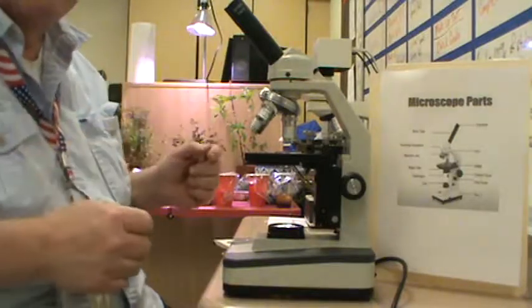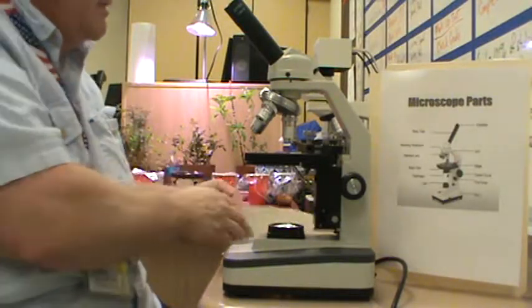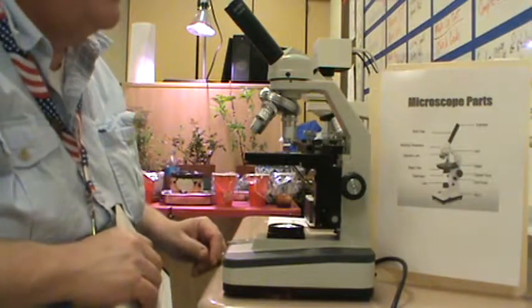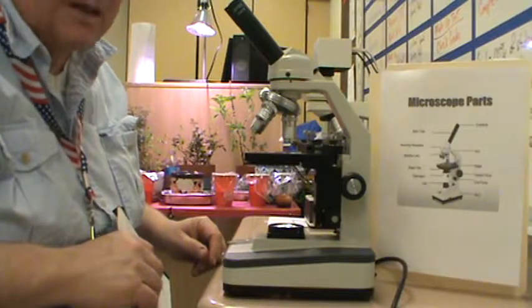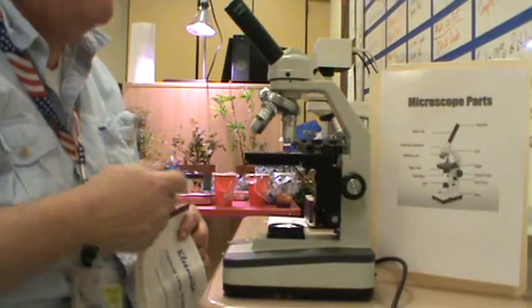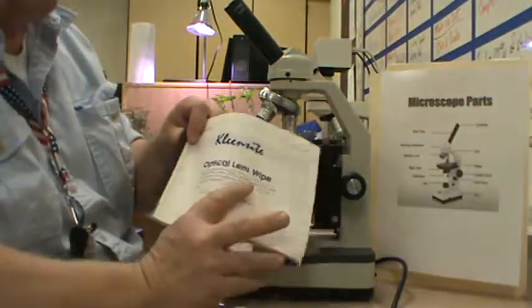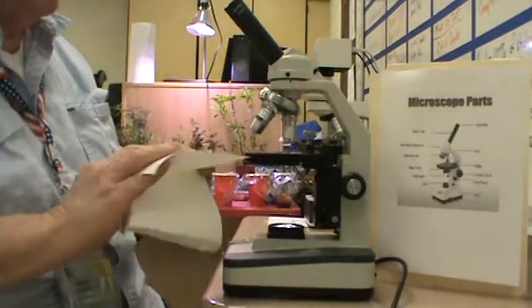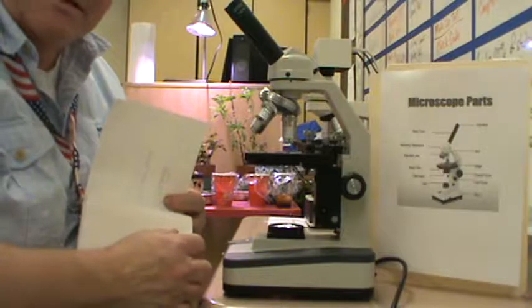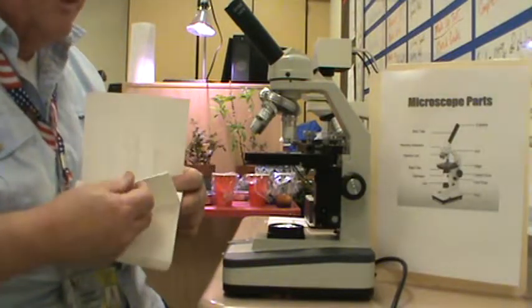Now, let's say that your microscope's been in storage for a while. You need to clean the glass. Please don't use your shirt. Please don't use a paper towel or a Kleenex. Those are very rough. Even though they feel soft to us, they're very rough and they can leave marks on the glass. You'll need something like optical lens wipes or optical lens papers, or if you have one of those soft cloths that they give you to do your eyeglasses like I have, you may use one of those.